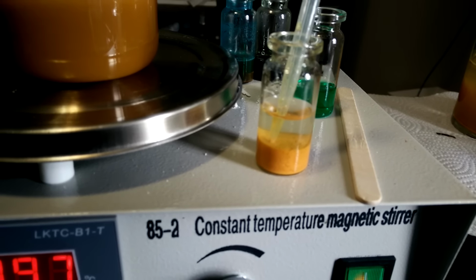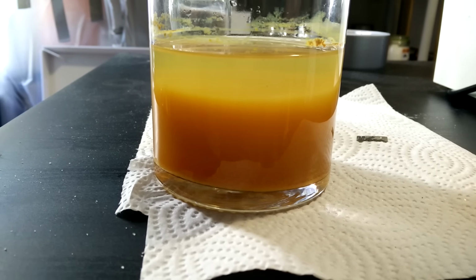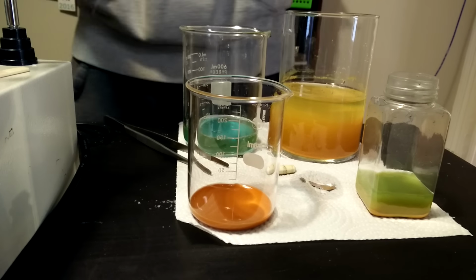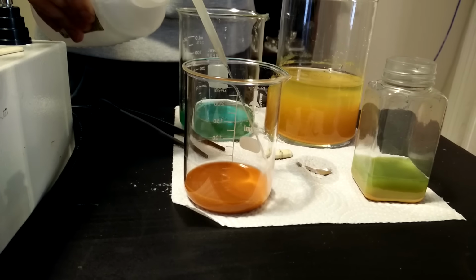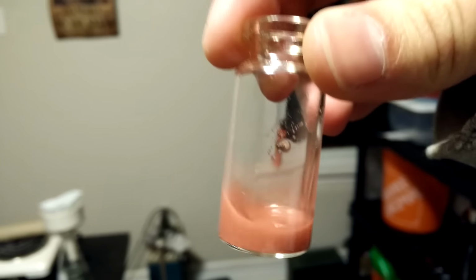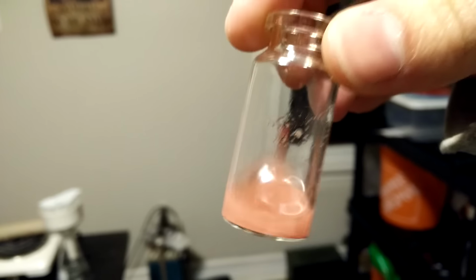One of the quirks of copper-1 oxide is that if the particle size is sufficiently small, it actually looks bright yellow or orange instead of red, much the same way that quantum dots look different based on their size. Sometimes during the synthesis you may get a mixture that turns orange. There are 2 reasons for this. If you add too much ascorbic acid, metallic copper begins to form, and the combination of yellow copper oxide and pink copper gives an orange mixture. Eventually, if you continue the addition, you'll get a salmon pink solution of only copper particles.